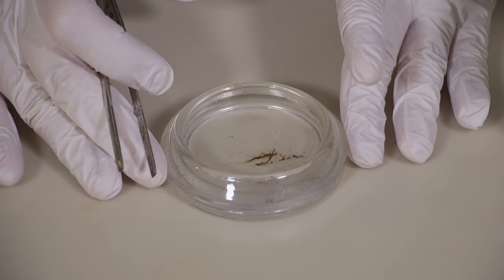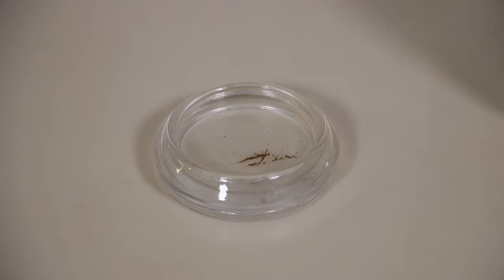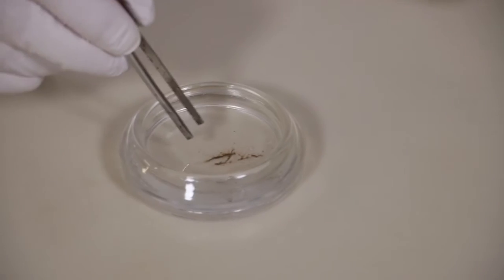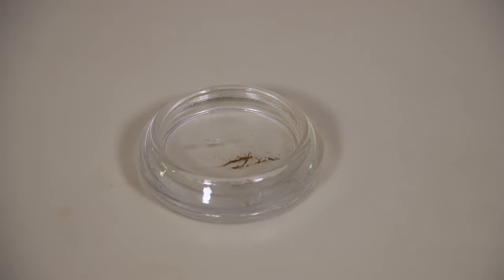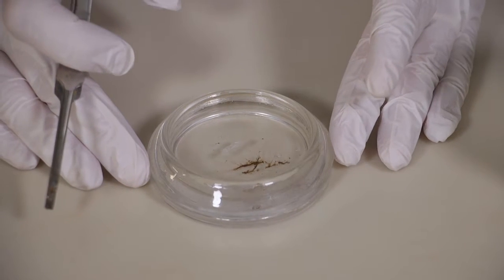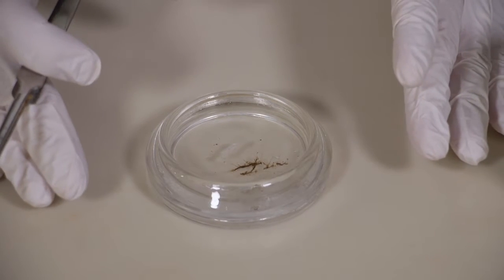This is a colony of hydroids that I've collected in the field and I want to preserve in formalin. We're going to add just one small menthol crystal. The menthol crystal will relax the polyps. You can drop it in the water and let it sit for a while. You will see the polyps will relax and will be unresponsive. You can check under the microscope or under the stereoscope to make sure they are completely relaxed.